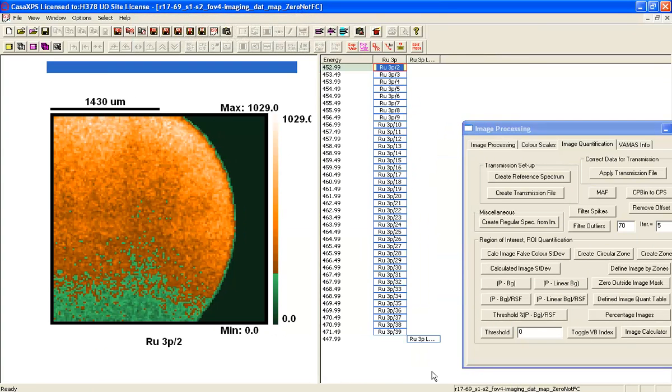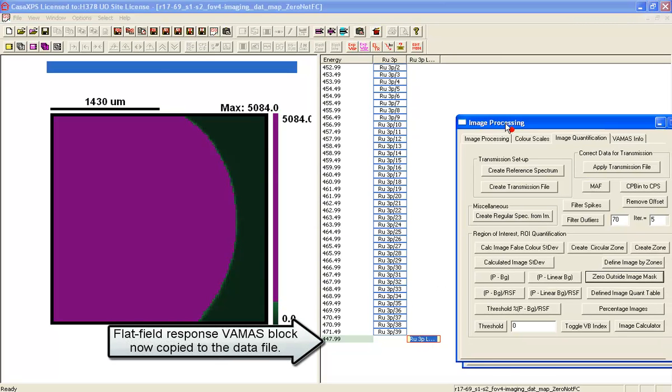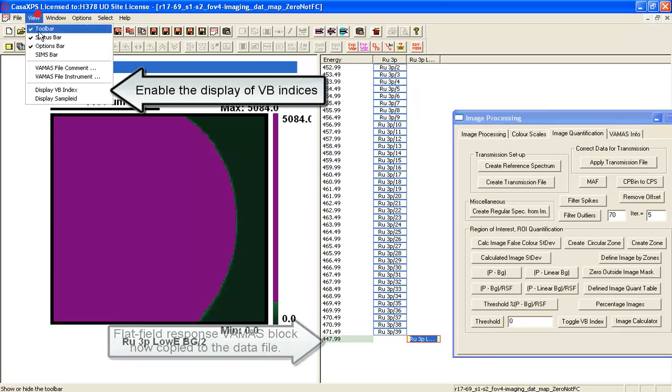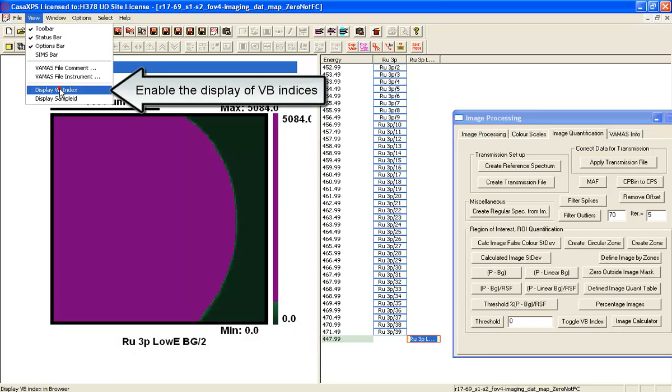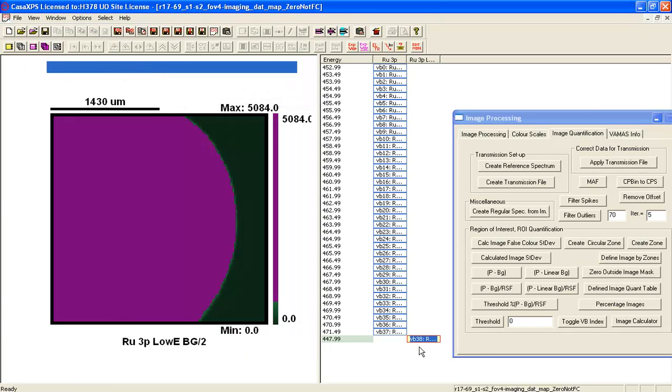And it appears within the list. And if I then just view the VAMAS block indices so I can see which is which, this is VB38.